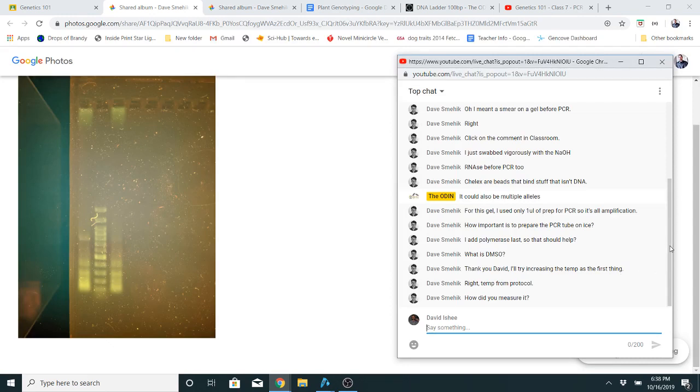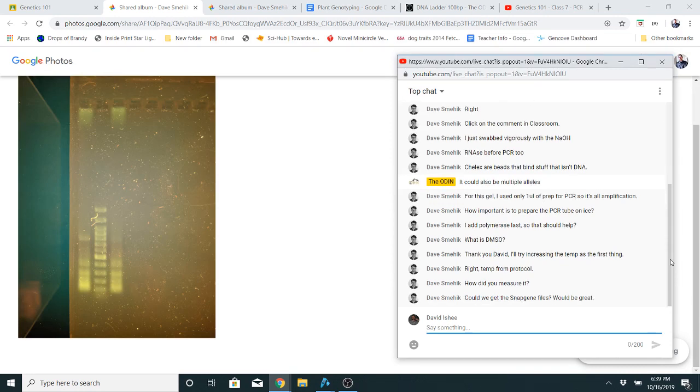If you are using a glass thermometer or something, you're going to need to give it some time. So you'd stick it in there. I would add probably some mineral oil into the well itself, and that way it gets really good contact.